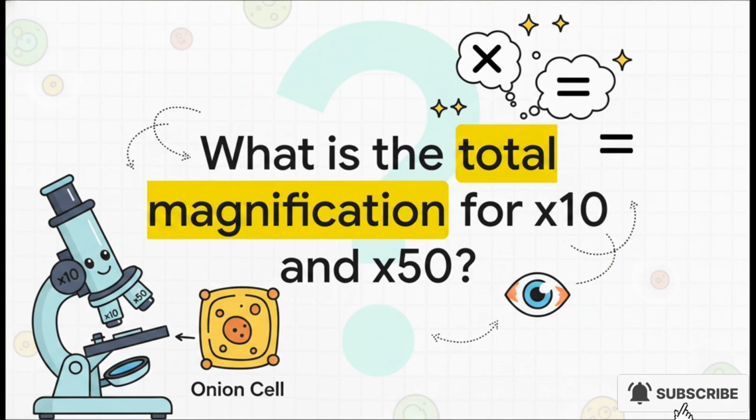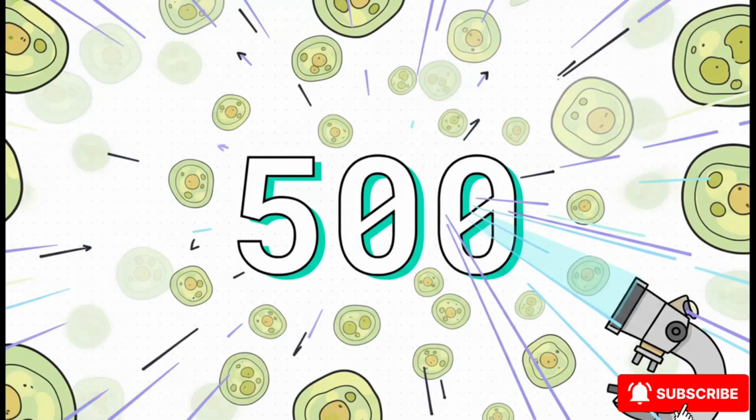Okay, let's put that into practice. Imagine you're in the lab observing an onion cell. The eyepiece lens has a times 10 magnification, and the objective lens you're using is set to times 50. Quick math, what is your total magnification? Yep, you got it, 500. You would be observing that tiny little onion cell at 500 times its normal size. That right there is the sheer incredible power of the microscope in action.